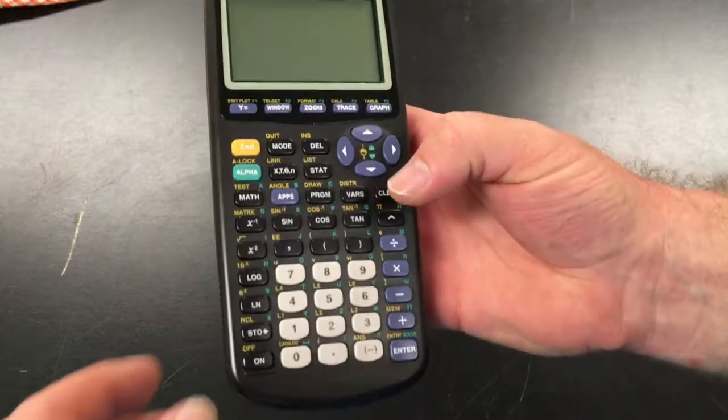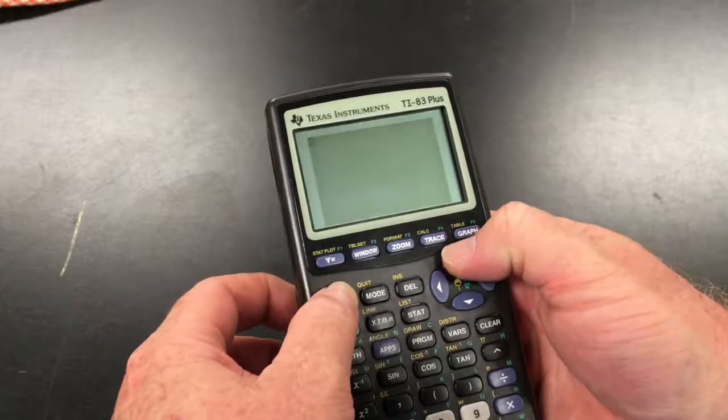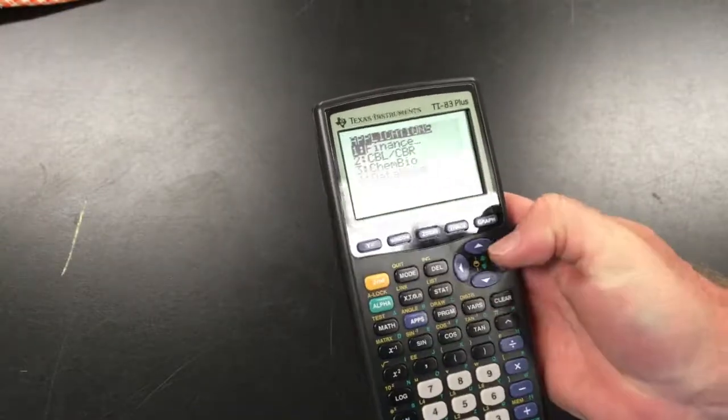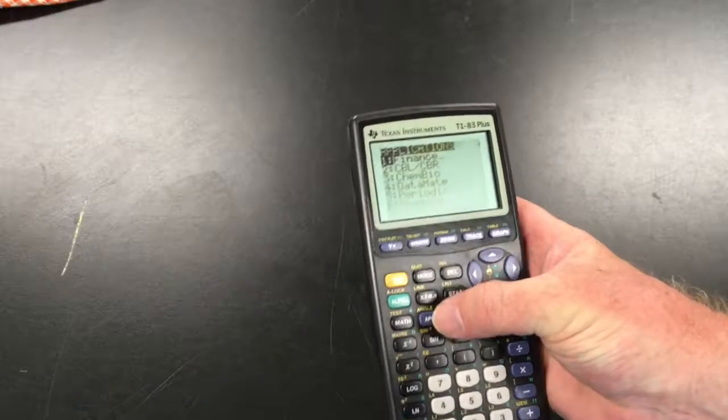Where is it? Down here. There. And you should have a screen. If it's too dark, press second and adjust. That we've got right there. And this will run apps and programs and do all sorts of things. We're mainly going to use apps.